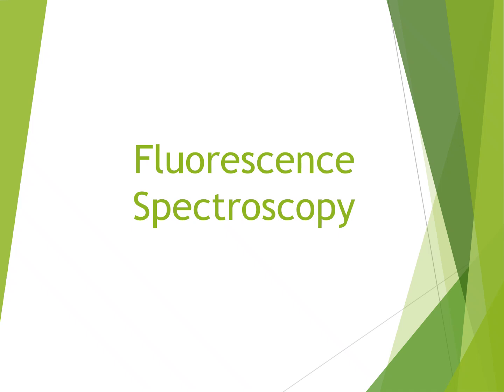Today's lecture is on fluorescence spectroscopy, which is one of the most sensitive and powerful analytical techniques used in modern chemistry, biochemistry, environmental sciences, and in medical diagnosis. In this lecture, we'll move step by step from basic concepts to advanced applications of fluorescence spectroscopy. I will explain not only what fluorescence is, but also why it occurs, how it is measured, and where it is applied in real life.